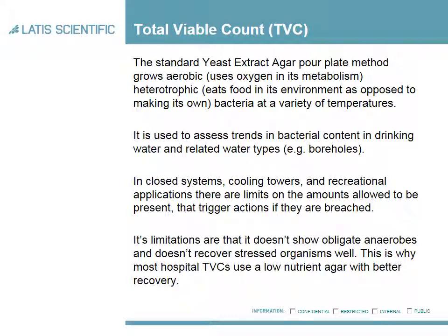It does have a few limitations, and the main ones are that it doesn't show bacteria that can only grow in the absence of oxygen, and it doesn't recover organisms which are stressed, whether by temperature or by biocides present in the water, very well. And this is why most hospital TVCs use different methods, including low nutrient agars with longer incubation times and some better recoveries.